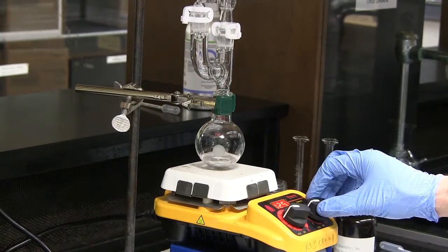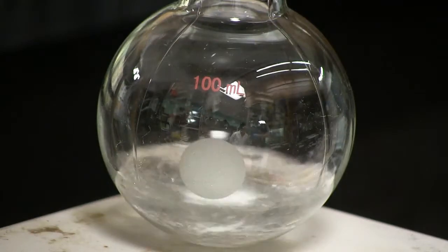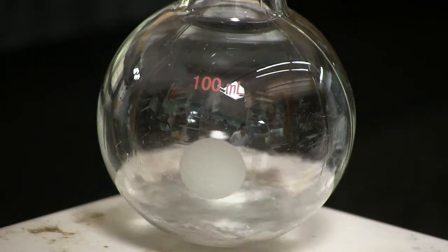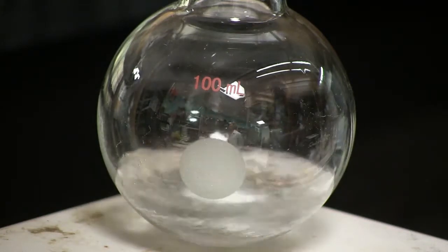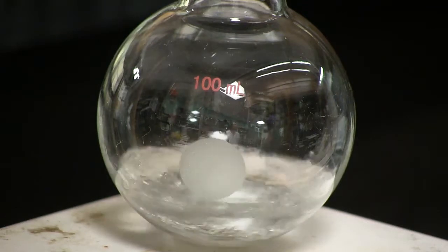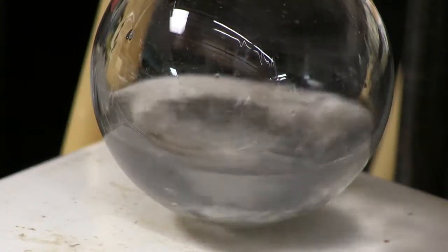Add about 1 milliliter of the bromobenzene solution to the pot. If small bubbles form at the surface of the magnesium turnings, or if the solution becomes slightly cloudy, the reaction has started. The flask then becomes slightly warm, and the diethyl ether may begin to reflux. If the reaction does not start within 5 minutes after the first addition, add a second 1 milliliter portion.